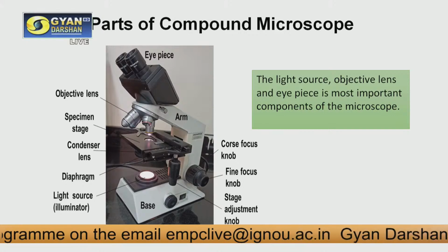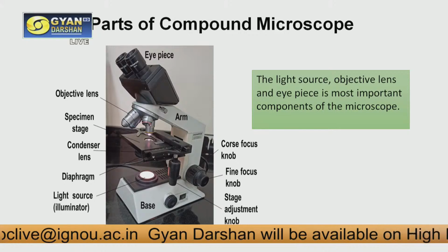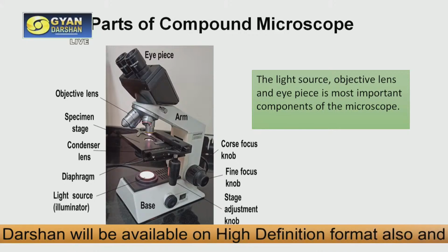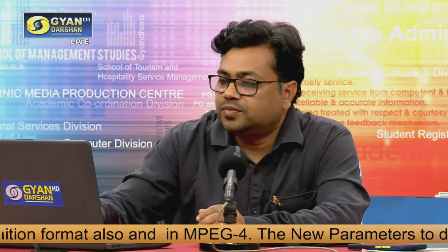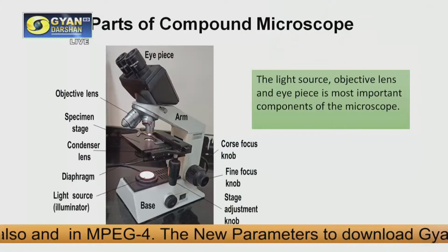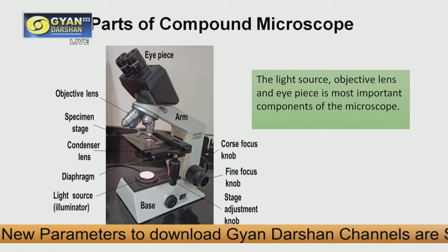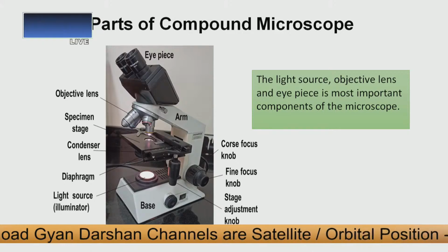These are the things that make the small specimen visible in the microscope so it can be seen by the human eye. The compound microscope enables us to visualize smaller things in bigger size. Here you can see the light passes through the condenser lens, and the condenser lens focuses the light onto the specimen, where we put the specimen under the microscope.